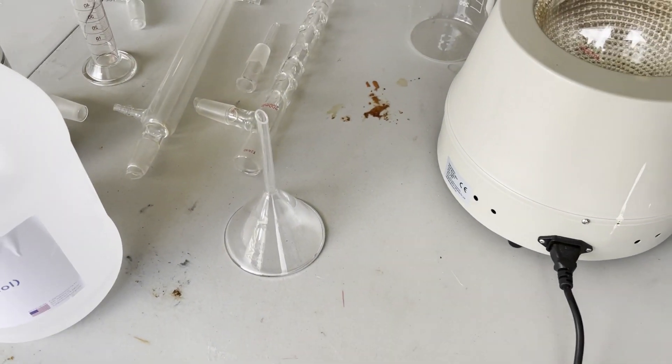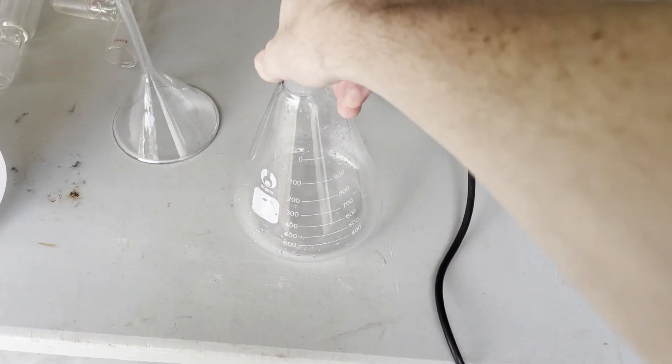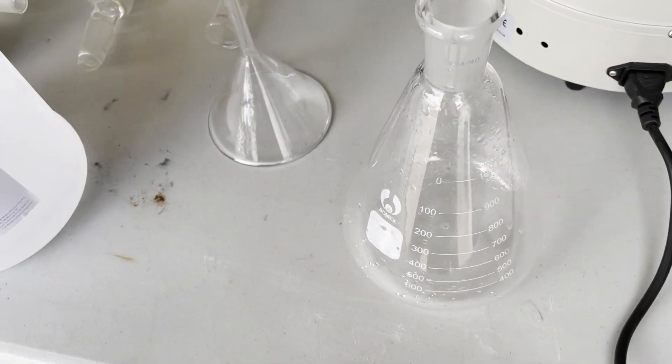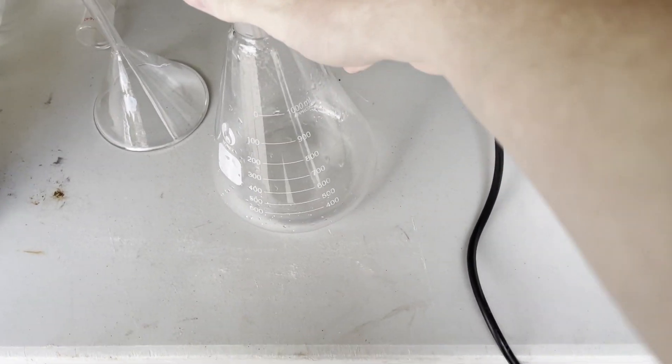Even though this ethanol claimed to be 99+ percent pure and dry, it was a very good idea that I went through the whole drying process, because when doing the calcium carbide step, I found that it was not as dry as it claimed to be.